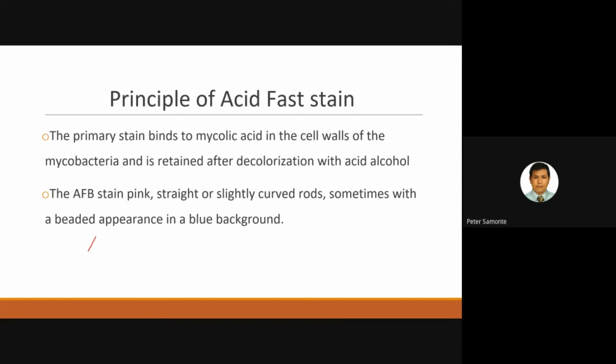The AFB stain pink, straight or slightly curved rods, sometimes with a beaded appearance in a blue background. So yung mga acid fast bacilli nyo, class, would appear pink daw. Pink, straight, or slightly curved rods. Sometimes with beaded appearance in a blue background.